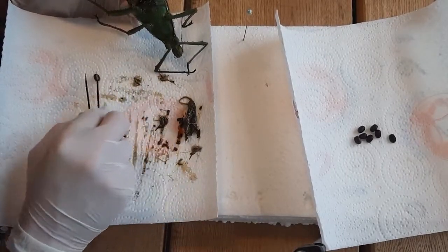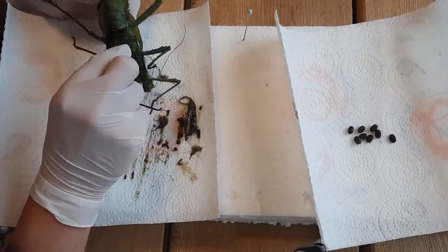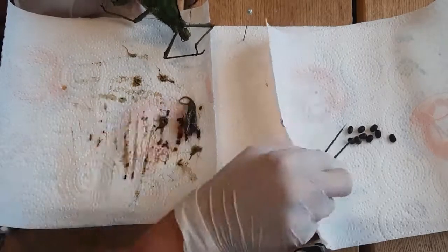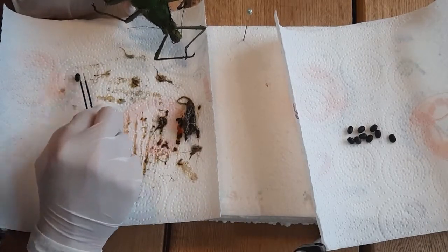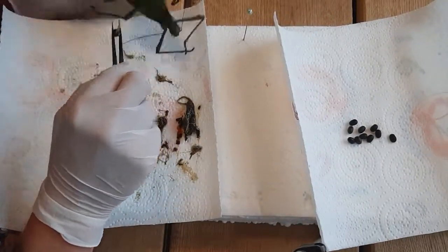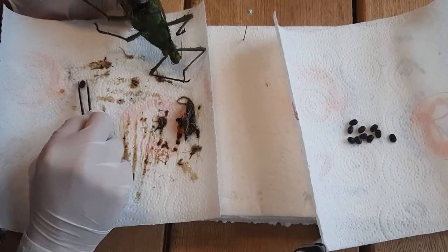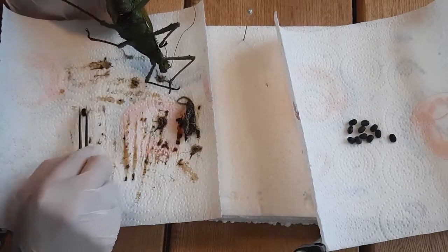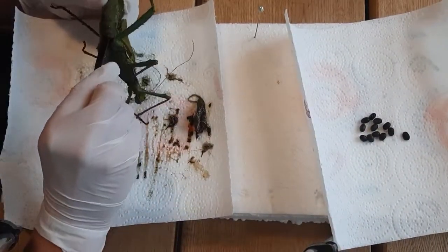This is a female, so everything I'm getting out that's round — those are the eggs. Since she couldn't lay many eggs before she died, there are many inside her body. These eggs can possibly still hatch. After extraction, they are dried on the paper towel and put aside. When the stick insect is mounted, these eggs will be put into moist soil, and in a few months they might hatch.